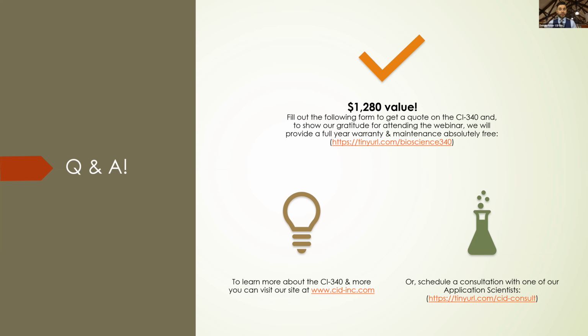What kind of information does the light intensity module provide? With the light intensity module, you're going to get red peak wavelengths at 660 nanometers, and blue peak wavelengths at 470 nanometers. Those are the LEDs on the module. It gives you an output range of 0 to 3,000 micromoles, and the precision of the PAR is plus or minus 15 micromoles per meter squared per second.